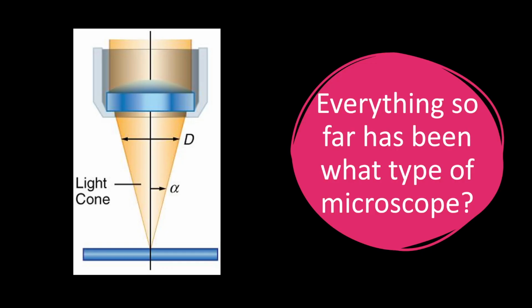So far, we've covered microscopes that shine light through a sample, but other kinds of microscopes gather information using different methods. For example, electron microscopes fire a beam of electrons instead. Because electron waves are far smaller than light waves, you can see much tinier details.